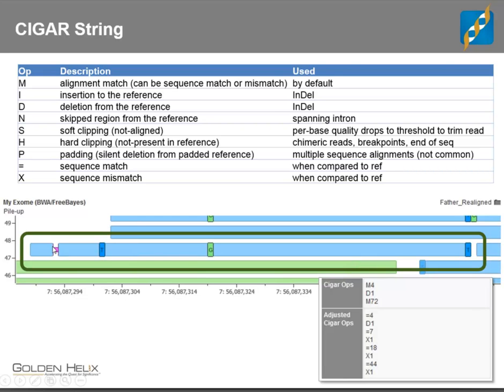And one thing to keep in mind is that we have to account for these gaps in the CIGAR string, and without that we don't actually even know what the length of the read against the reference sequence is, because again the SAM file just has the chromosome start and then the full-blown set of letters that came off of the sequencing machine. So with this CIGAR string we're saying something like, okay, there's 4 letters that are in sync with the sequence, then there's 1 letter where I'm gapping or deleting against the sequence, and then I have another 72 letters where we're in sync with the sequence.